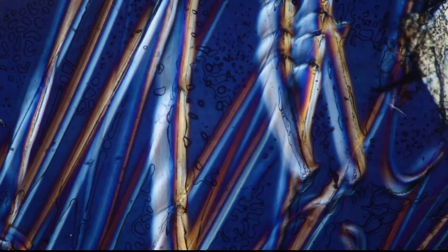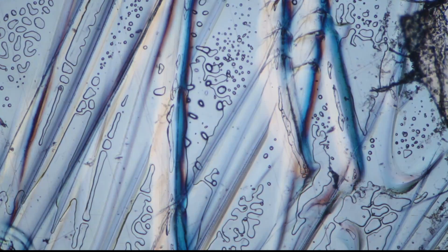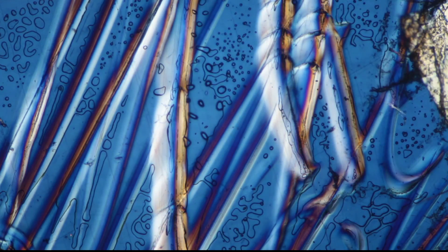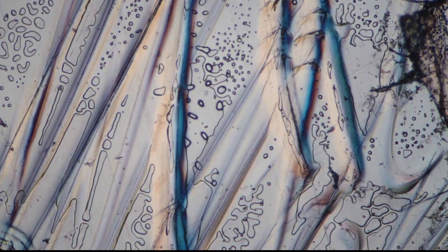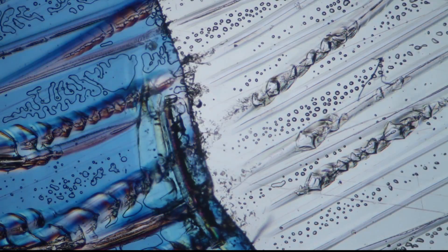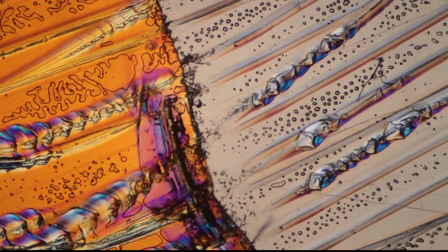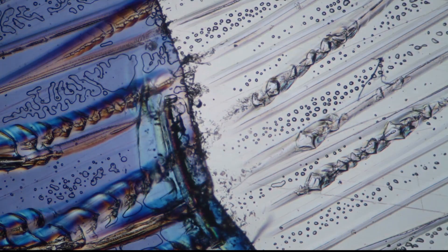Here you also see the nice scratches again making everything appear a little bit more interesting. And those bubbles that you see, these are the bubbles that you can actually see in the glue layer of the tape.